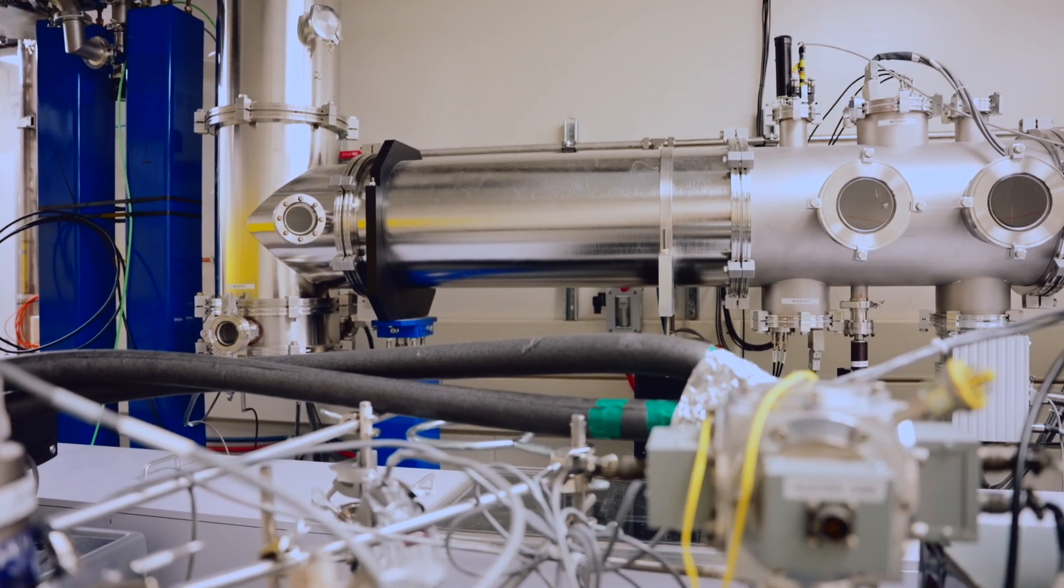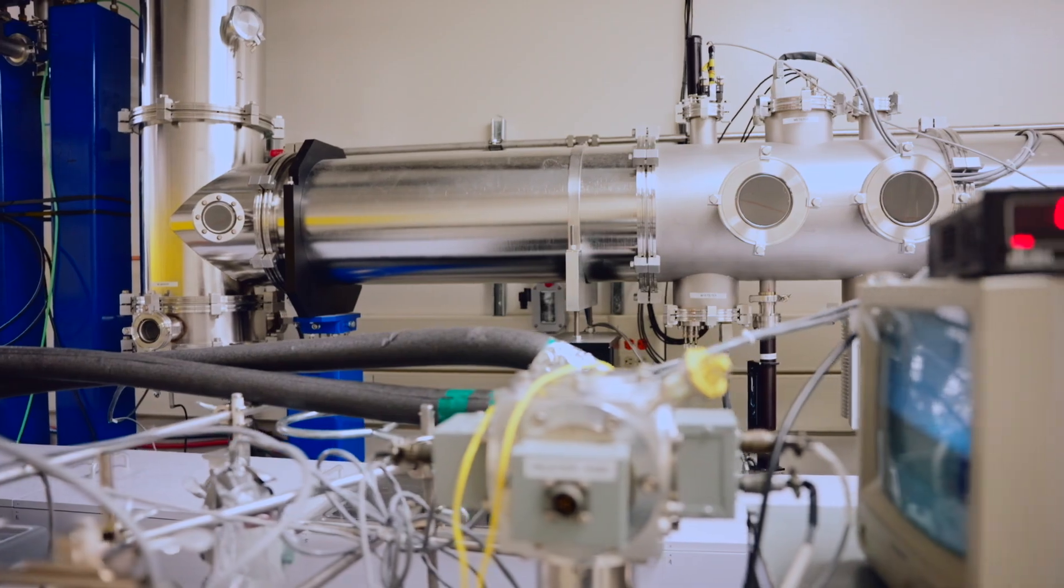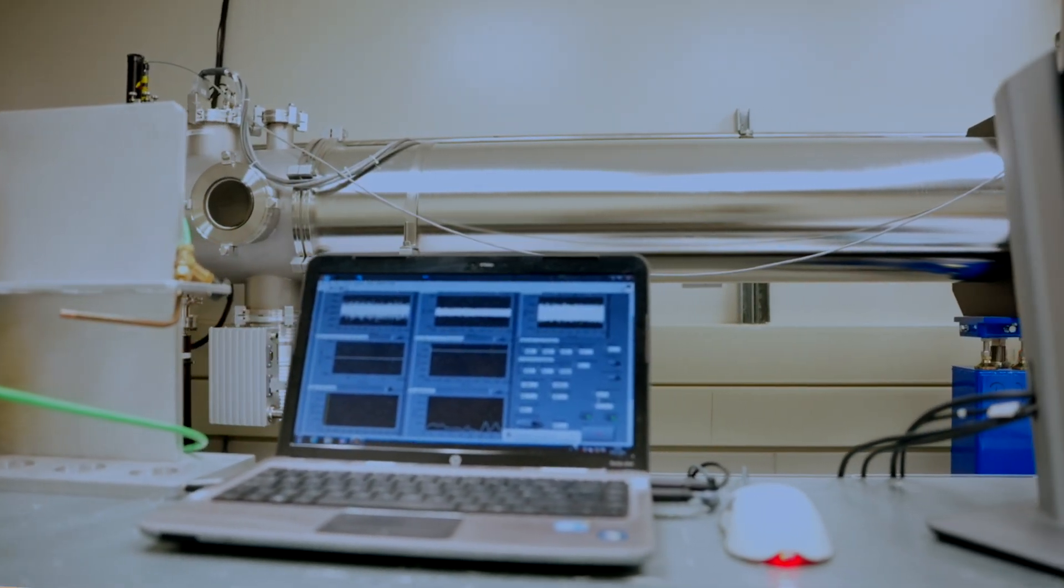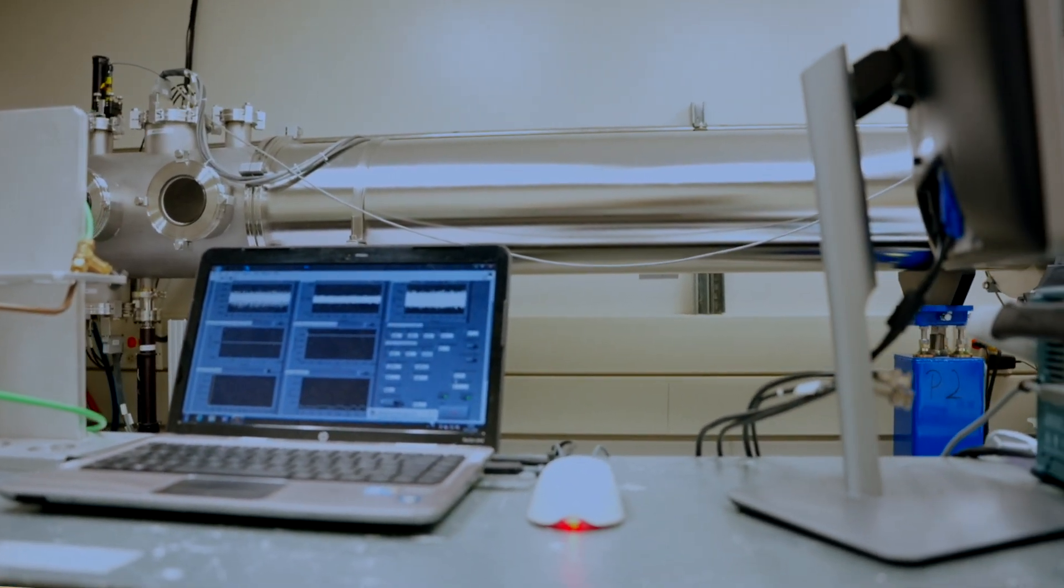In conjunction with that we have a long pass gas cell which was made by NRC. It has a pass length of up to 72 meters, so we can have very low pressures of gases inside, which allows us to take advantage of that high resolution.